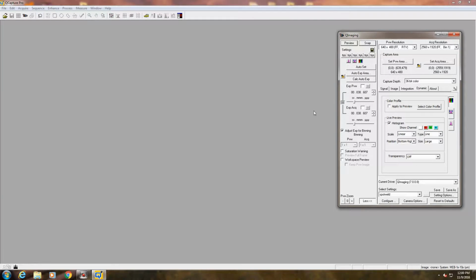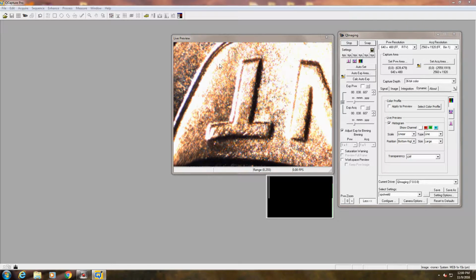Okay, with the penny all ready to go, we're back in the computer. It's pretty much the same process. You can actually keep the window open for capture. So you go to preview, and again, same deal. We get a live feed. If you need to just adjust the focus. It looks okay in this case, and just make sure you don't move as much so you can see a bit of wobble. Okay, what you do, again, same thing, snap.